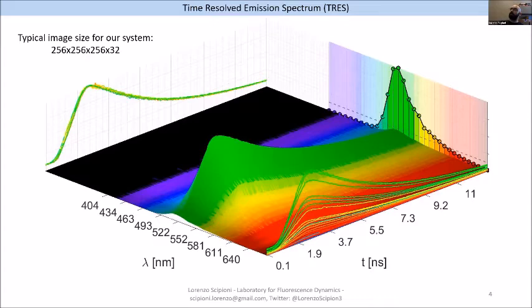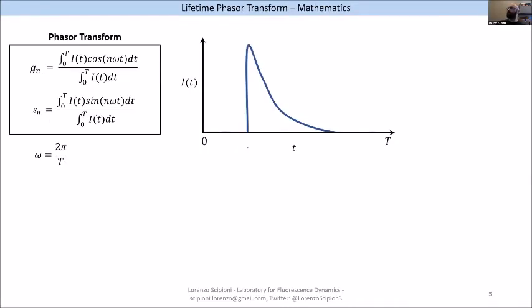And since we don't like to settle with processing it in hours, we want to have also something on the computational side that allows us to see whatever we are acquiring in real time. So how do we do that? We do it with the Phasor approach, of course.